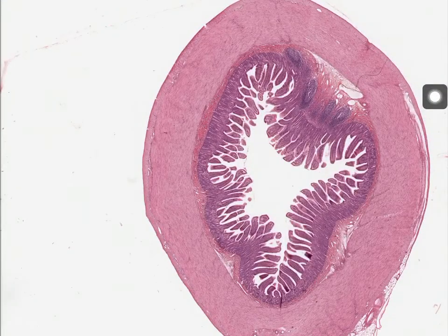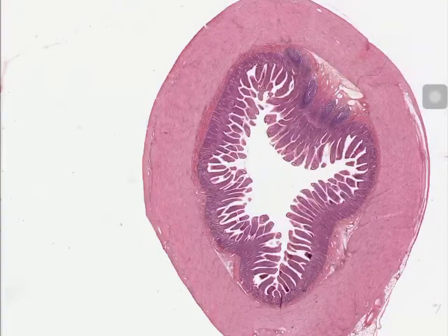All right. Another thing to note, and actually no, let's just go to the third specimen, and then we'll come back to this here in a moment. All right.